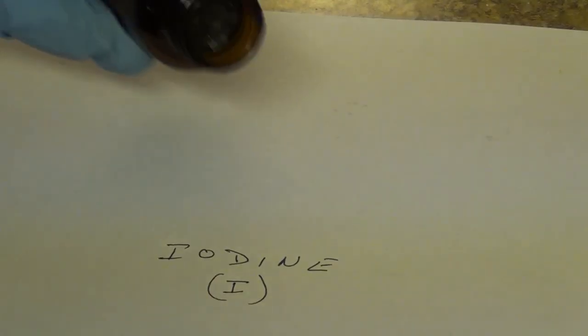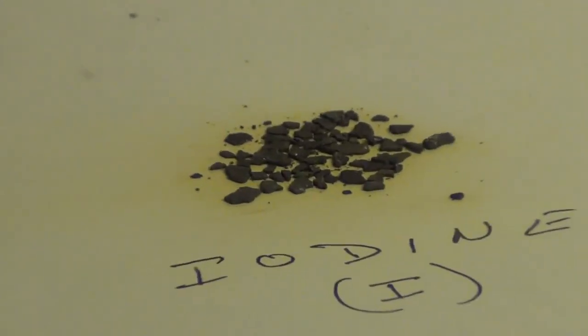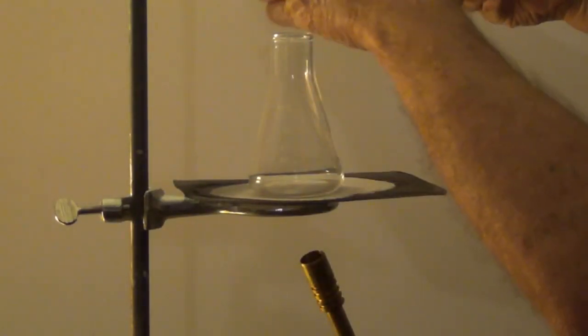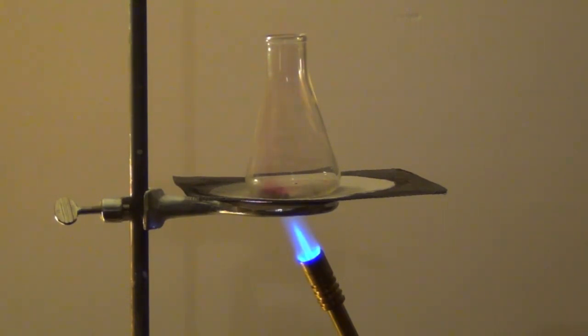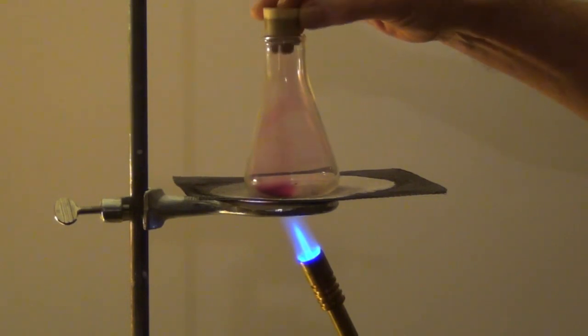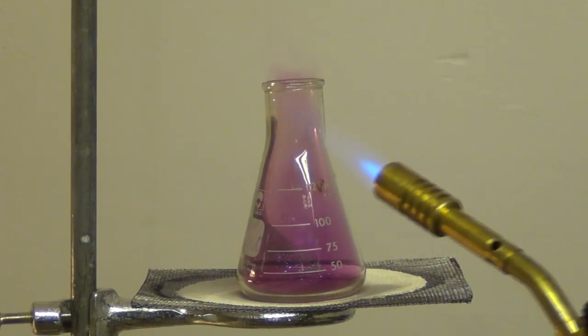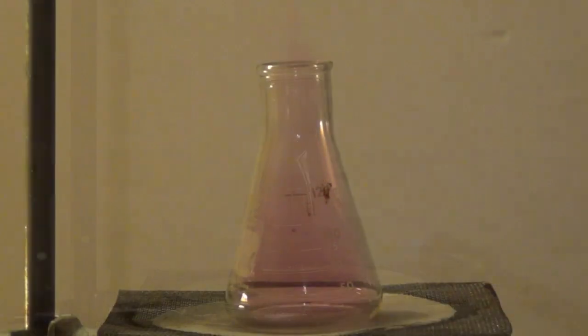And the most curious of all is a solid called iodine. Iodine is a solid at room temperature, but with very little heating it can be turned into a beautiful purple gas through sublimation — the process of evaporating from a solid to a gas without going through the liquid stage. Here, I'm placing some iodine into an Erlenmeyer flask and heating it, and within a matter of seconds the iodine begins to turn into a beautiful purple gas. I'm temporarily placing a stopper on the flask so the buildup of gas can be more obvious. The gas swirls around from convection, and as the flask is cooled, the iodine condenses and forms crystals on the side of the glass. When heating is continued without the stopper, all of the iodine eventually sublimes, leaving nothing in the Erlenmeyer flask.